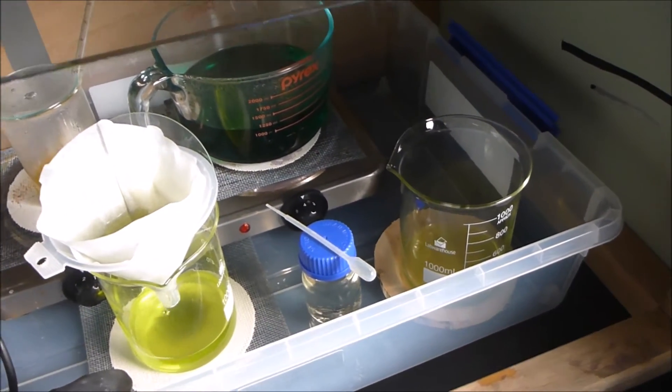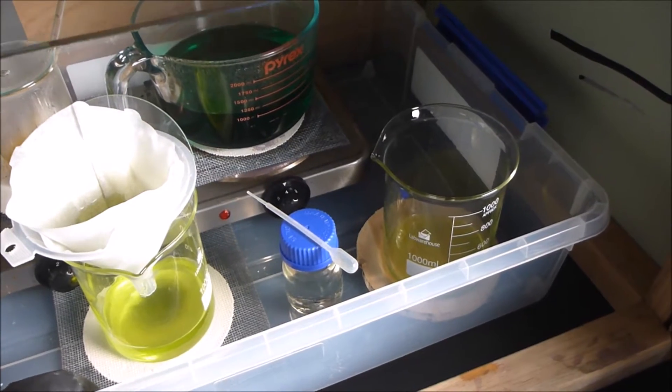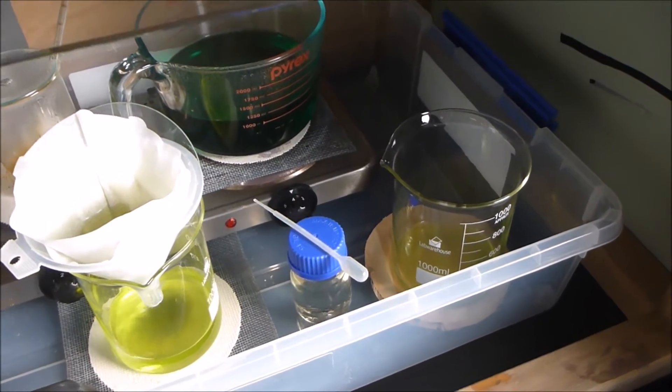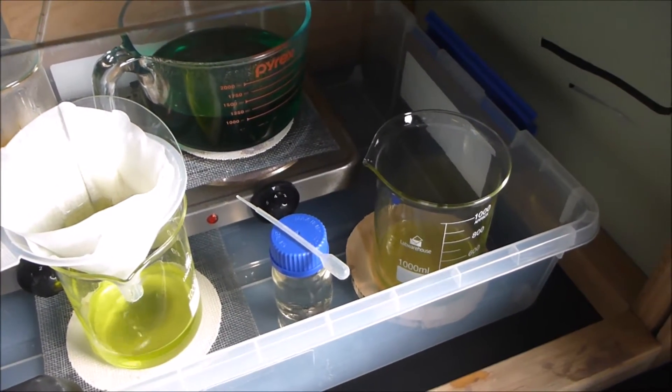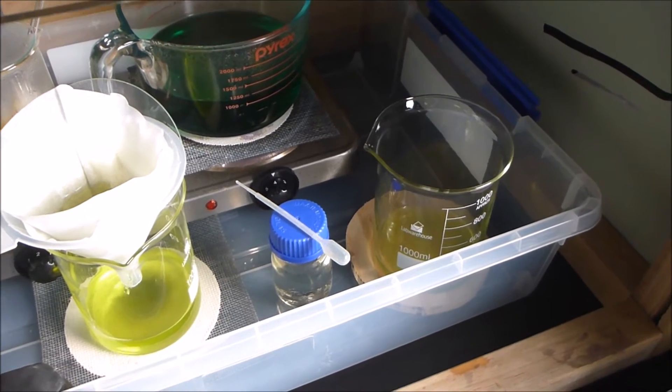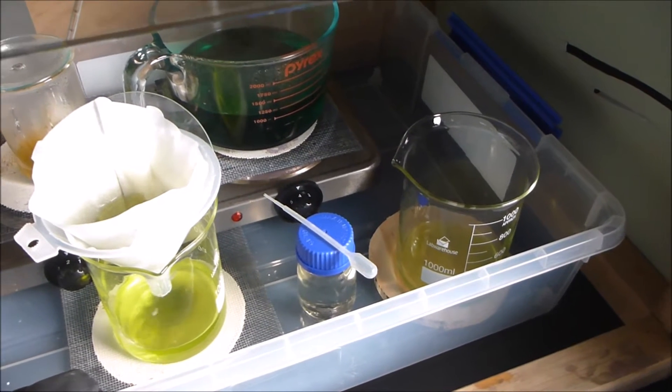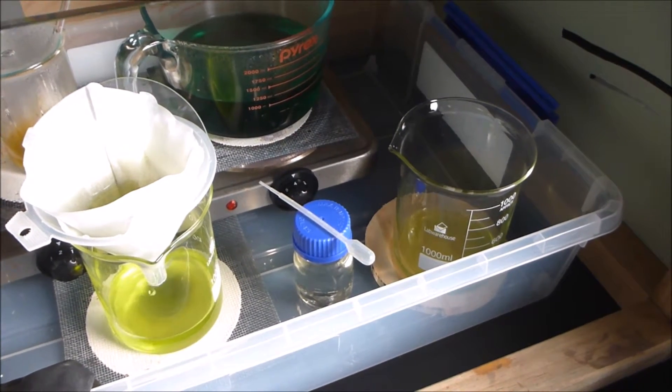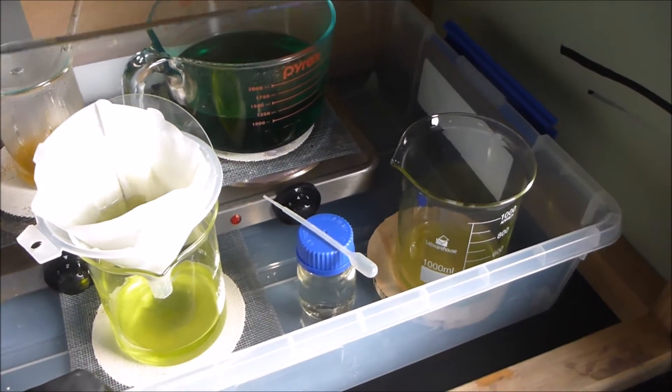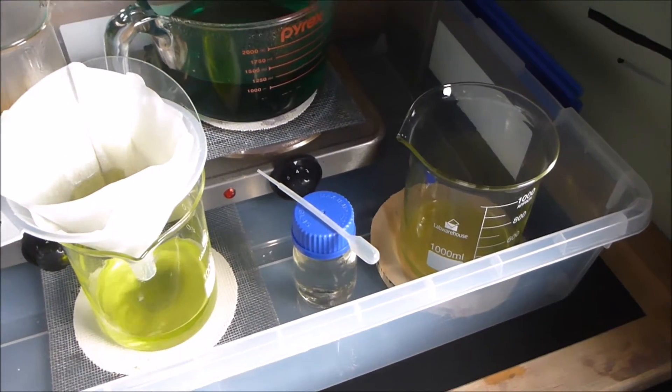I ended up with a really ugly looking gold button at the end of the melt. Ever since then, I'll take an extra day of work to get a crystal clear solution if that's what it takes, rather than precipitate gold in a solution that's not crystal clear.